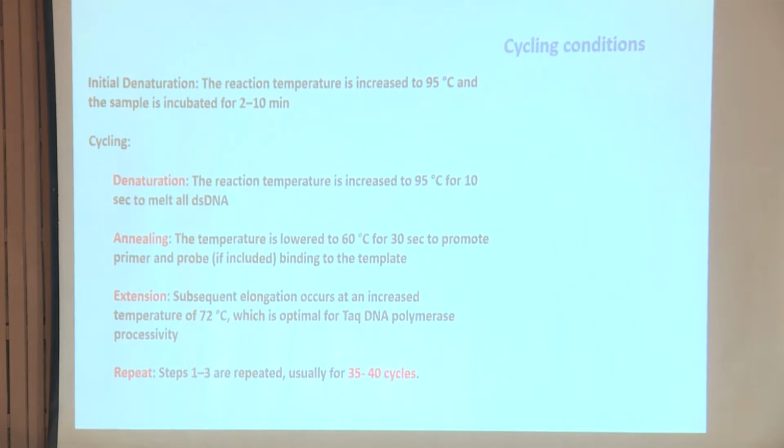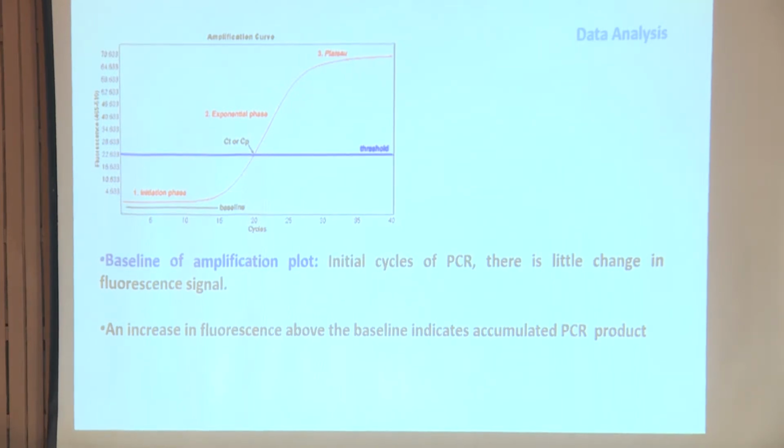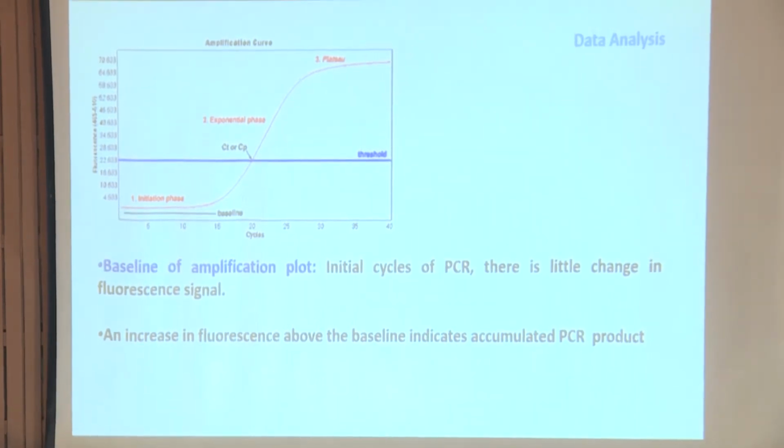This may not be exactly the one displayed here, which I just showed. There is no difference. It is much like the normal PCR. You have a denaturation, you have annealing, you have extension, final extension. That's the classical workflow that we normally do. Now I will introduce some terminologies. We will have a detailed discussion in the practical class. Let us not have a very elaborate discussion here.